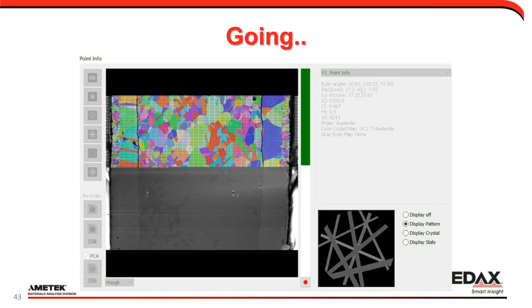Now, I get asked this question quite a bit, so I'll just tell you. You can see that it looks a little bit blocky in there. That's just a pixel resolution thing. We are taking a hexagonal grid and putting it onto basically a smaller pixel size on your computer, and also shrinking it. So that's just an artifact there. That blockiness you see is not your data. In this case, it's a display issue.